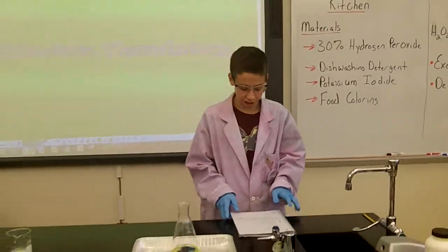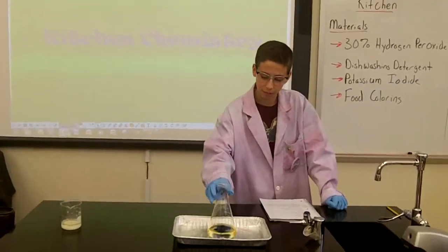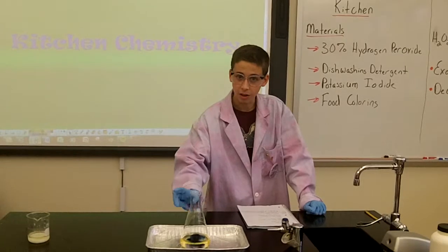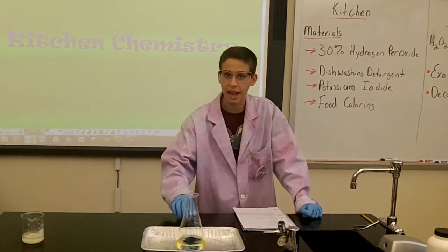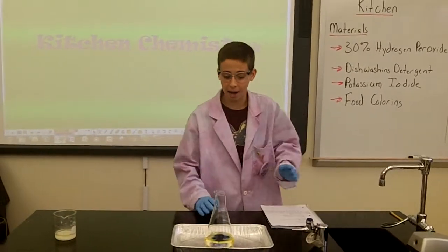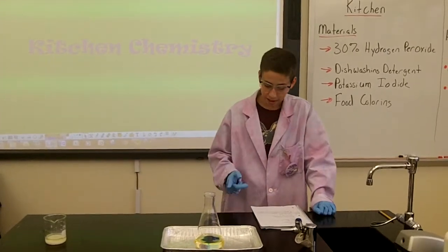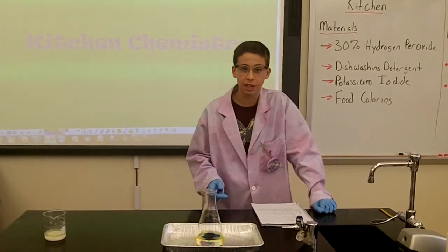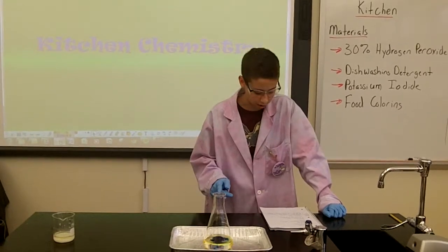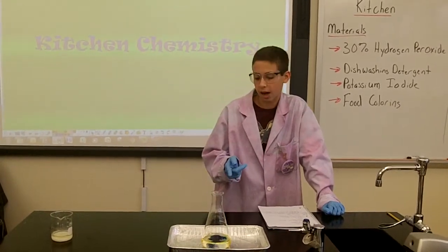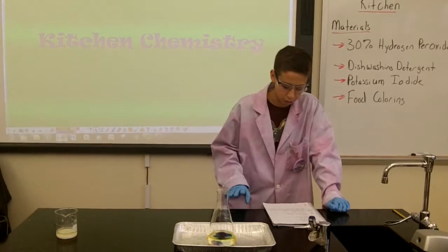And for our procedure here, you're going to want to put our flask here in the middle of the little tray. That way you can catch all the fallout of this reaction, which is going to be quite a bit here. And in there, we've actually got 100 milliliters of 30% hydrogen peroxide, we've got some food dye, and we've got our two squirts of dishwashing detergent.